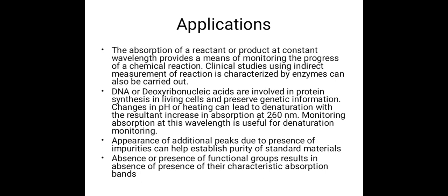Applications: the absorption of a reactant or product at constant wavelength provides a means of monitoring the progress of a chemical reaction. Clinical studies using indirect measurement of reactions characterized by enzymes can also be carried out.